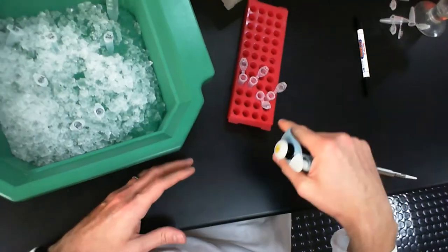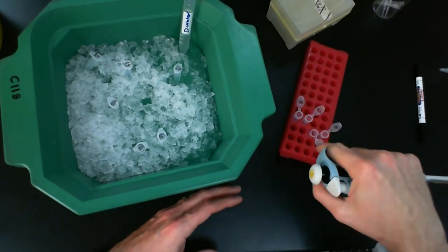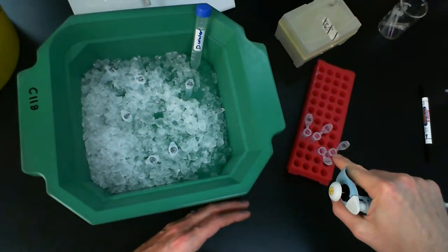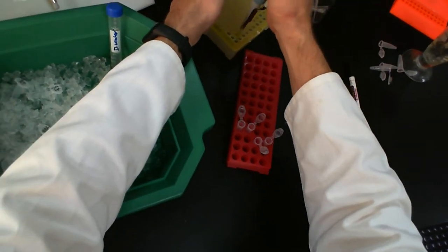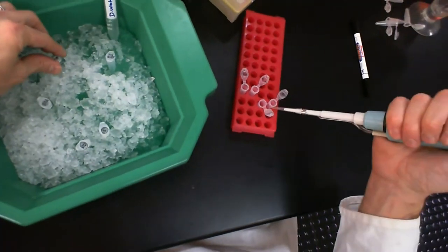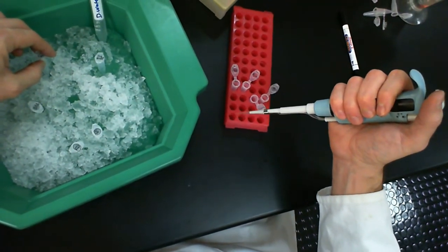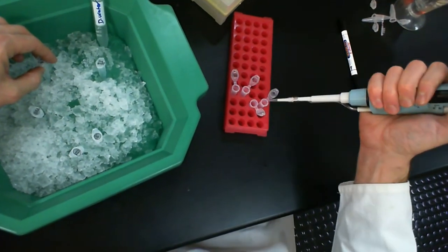Okay, so notice that as I'm doing this, each time I am moving things over by one space. This way I know how far along I am in my procedure. So even if someone distracts me at this point with some question, I can still get back to it and remember exactly what I'm supposed to be doing next. Okay, so at this point I know I've already added my water. I've added, that's this one, I added my buffer. Now I've added my DNA. This one still needs DNA.